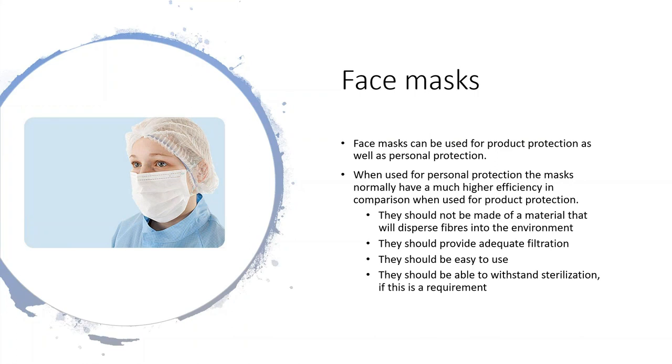So one of the biggest organisms of concern are the streptococci. And there are some varieties of tryptone soya agar, TSA, out there which cannot actually adequately detect streptococci. So you may have a problem with poor mask control without knowing it, because you're not actually able to detect the very organism that you're concerned about.